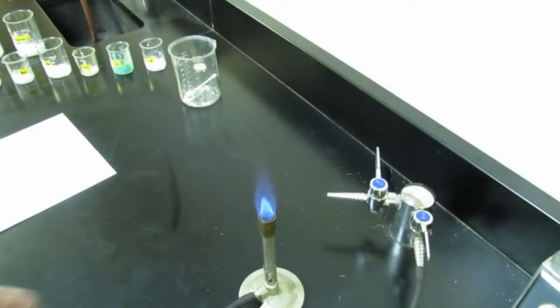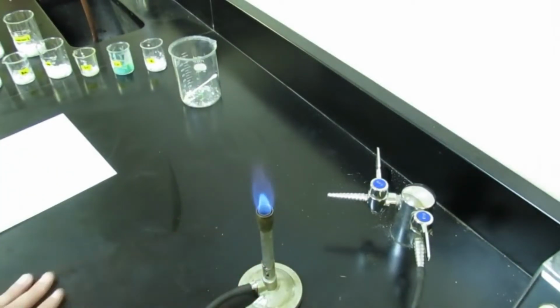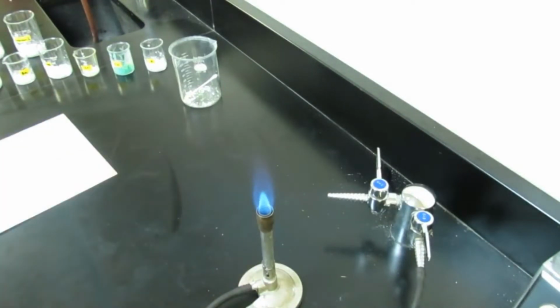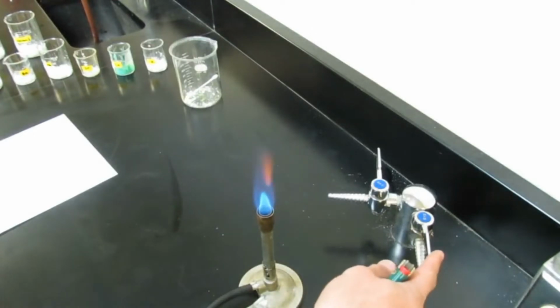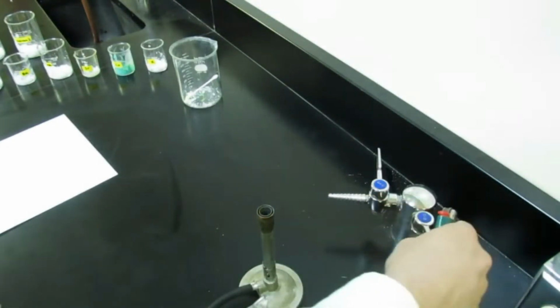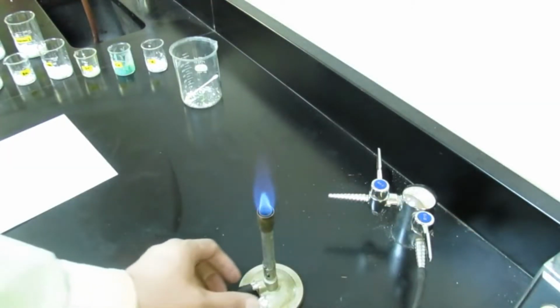It's pretty simple. The air intakes on the bottom should be wide open, as they are here. That gives us a nice light blue flame, and for this experiment that's important because we want very little color in that flame, at least color caused by the burning natural gas. To turn this off, you just turn it the rest of the way, and it shuts off. So once again, we'll turn that on and leave it on. Once again, make sure your safety glasses are on throughout the duration of this experiment.